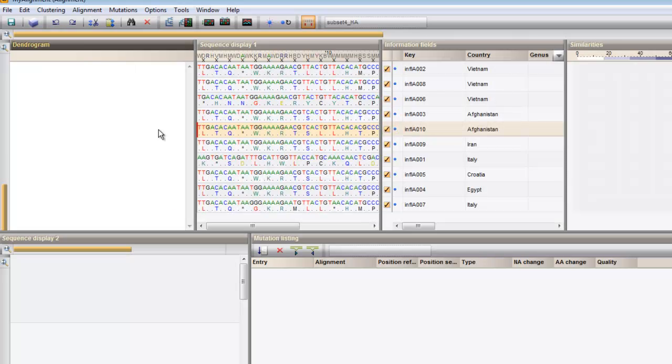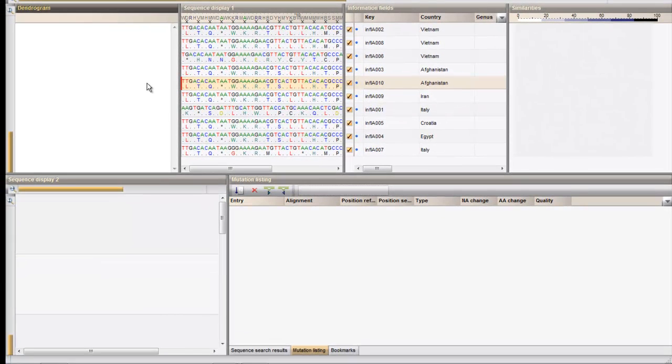The complete alignment or any selection of sequences within the alignment can be searched for the occurrence of a subsequence. To start the search, press the Find sequence button in the Sequence search results panel.